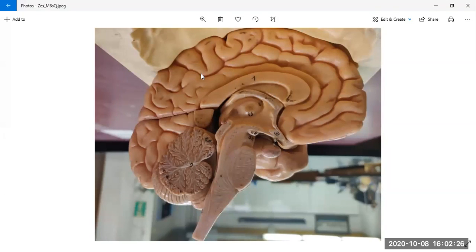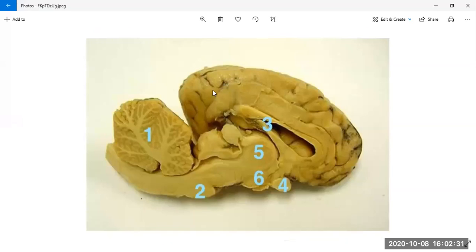This one is the motor brain. Actually, let me go back. This structure, the bumpy one in the back, is the occipital lobe. This is the vision center. And this one at the front is the frontal lobe, and somewhere in the middle is the parietal lobe. Frontal lobe at the front, occipital lobe close to the cerebellum, and between them, somewhere here, the parietal lobe. Yeah, probably this is the division.